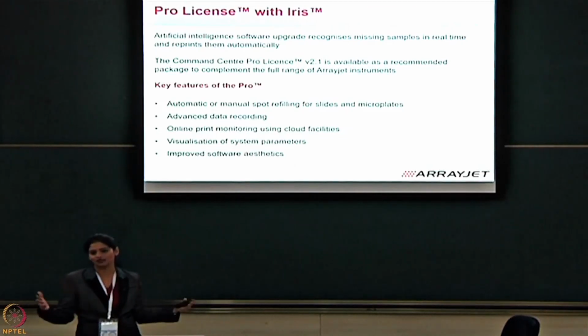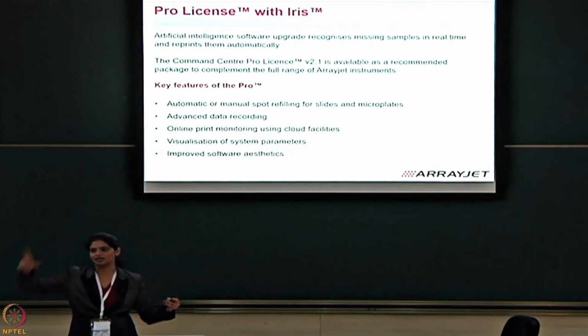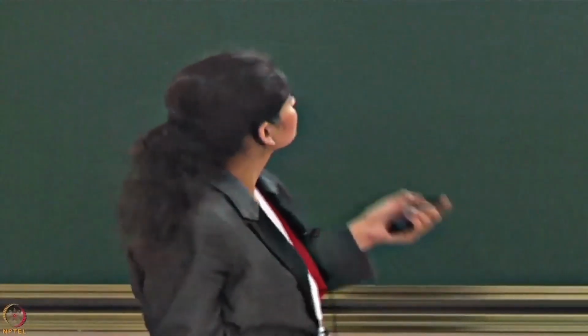If it's a long assay, maybe 4 hours, and you have other things to do, you can press start, go away, and come back after 4 hours, and you'll have a few files waiting for you in your cloud. They say: this is my assay, this is how successful it was, how many missing features there were, whether it was able to detect all my antibodies, what my data is. It'll give you a couple of reports. You just take those reports and post-process them automatically with your secondary antibody or whichever method, RPPA, whichever method you're using to characterize.